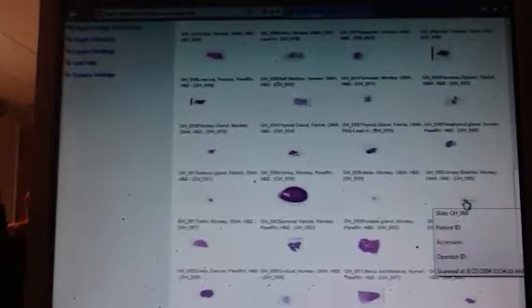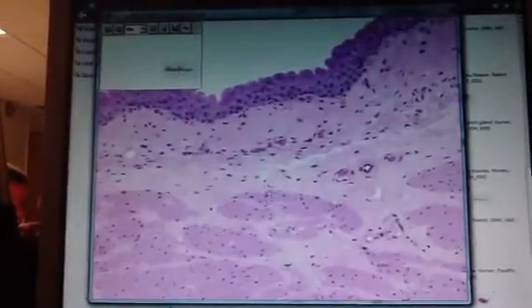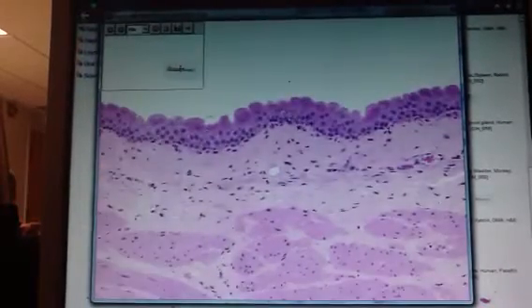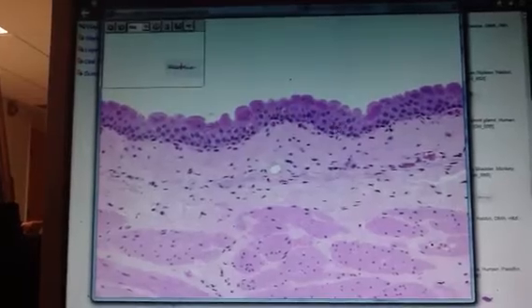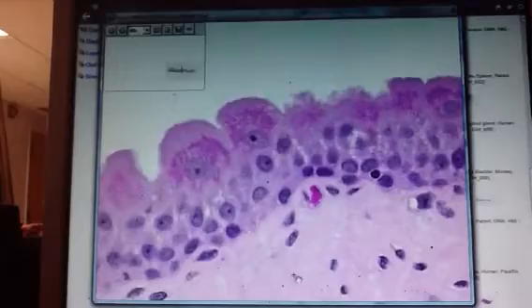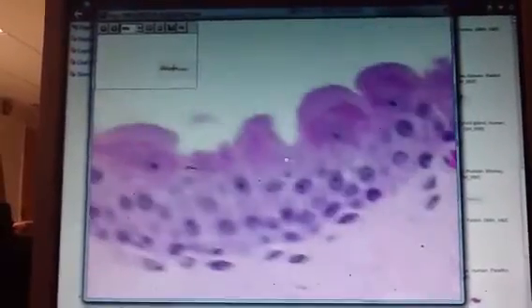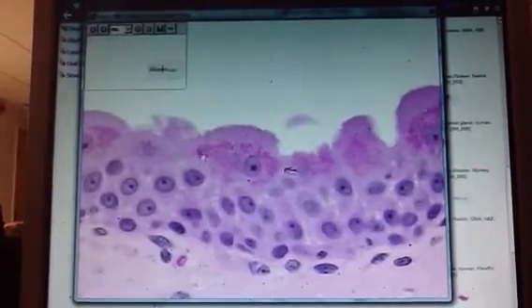Okay. So here we go to this wonderful tissue. It's got two surfaces. You've got to find which side is the luminal surface versus the other. So here's the lumen out here. When you look at this group of cells right here, you can see it's a stratified tissue. All right? But what is the shape of the outermost layer of cells? Big, huge dome-shaped cells. Big, puffy, cloud-like, cotton candy-like cells.